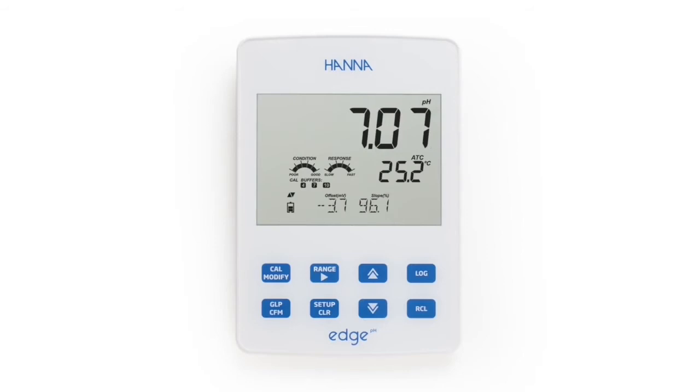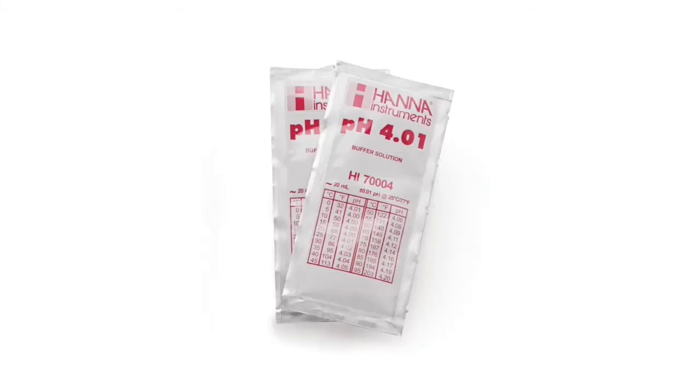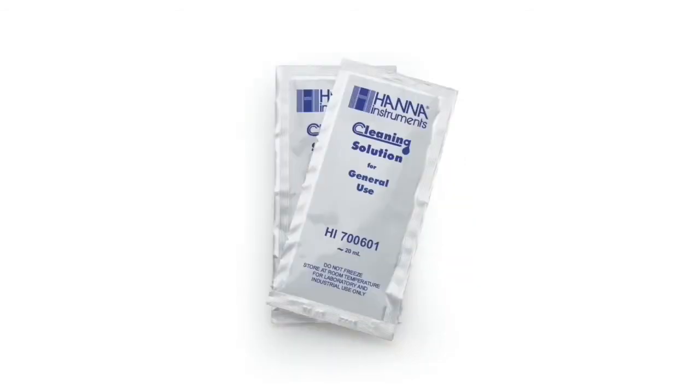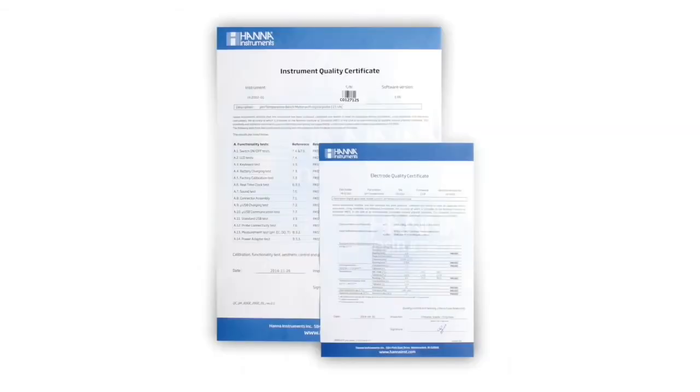Along with the meter you will receive the following: the HI11310 combination double junction pH electrode, a benchtop charging cradle with electrode arm, two sachets each of pH 4, 7, and 10 buffers, two sachets of general purpose cleaning solution, a wall mount charging cradle, an instruction manual with quick start guide, and the instrument quality certificate.